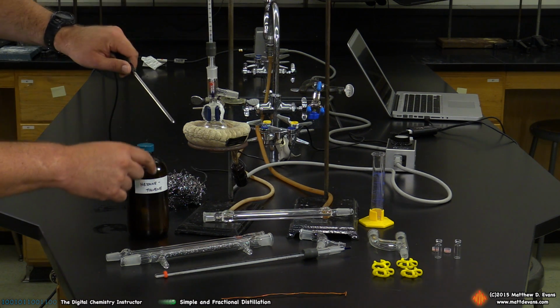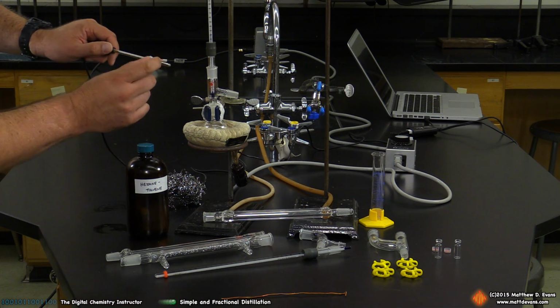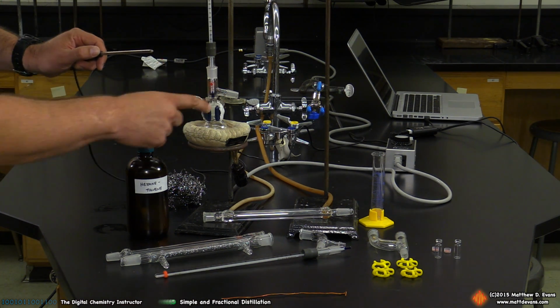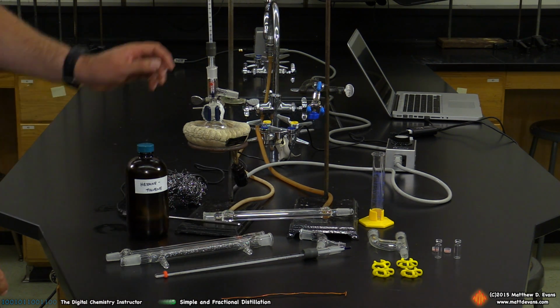We're going to push it through the adapter, and you're going to try to position the end part of this tip in a similar manner to this, where you want maybe the last half centimeter of this probe in line with the lower part of this three-way adapter. That's the proper setup for a digital, at least as far as I'm concerned. So, all right, what else?